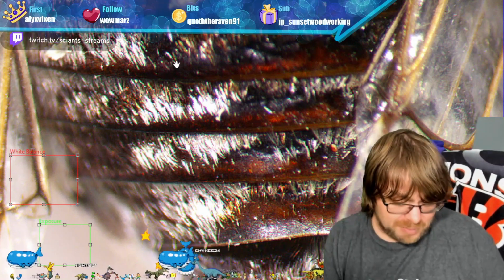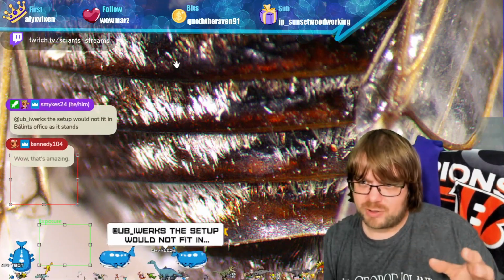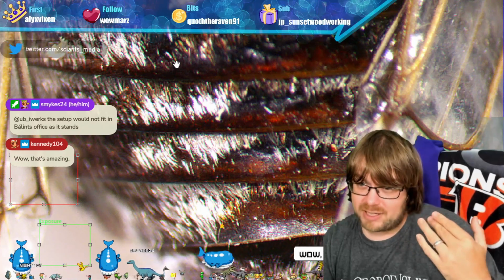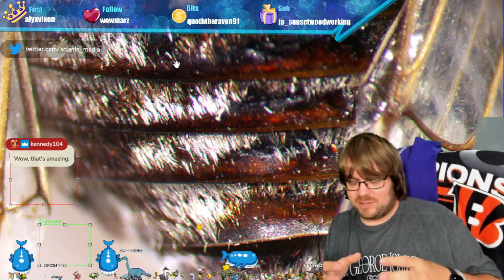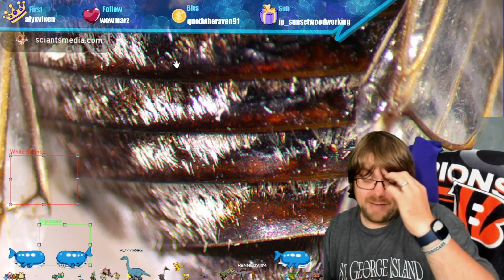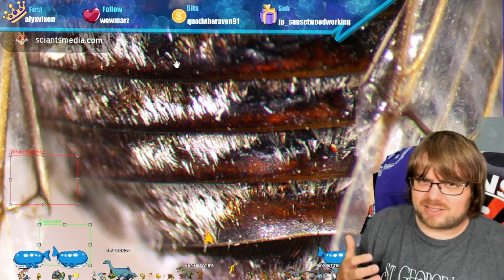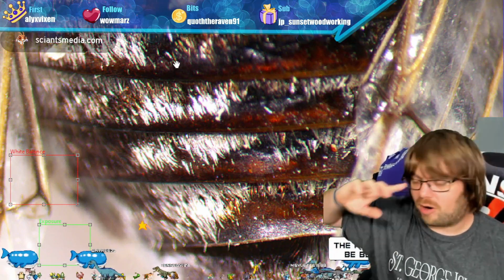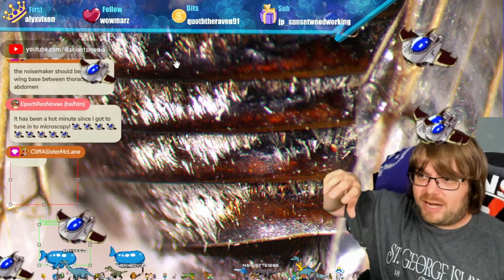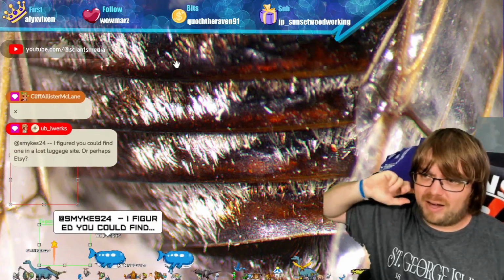I'm not sure if this is a male or a female, but with females, their ovaries expand and shrink with respect to food intake. And so that also allows them to change the size of their abdomen based on that fat content size. If it was all one solid piece, which is usually what I think these insects look like, just a solid piece of armor, then there's no expansion or contraction. There is just a single type of body plan.